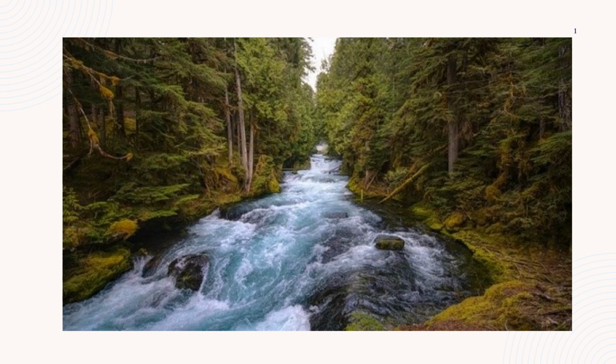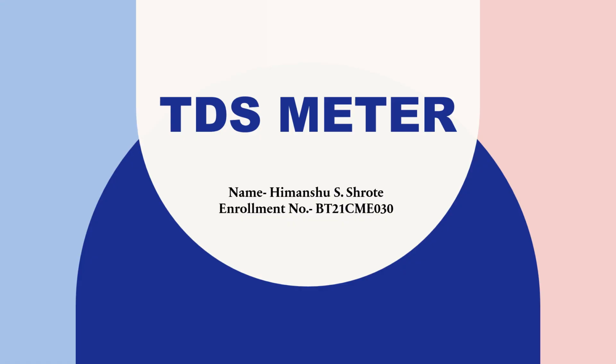Water. Water is the essence of life, but how do we ensure its quality? Meet the TDS meter, a simple yet powerful tool for measuring total dissolved solids. In this presentation, we will explore what a TDS meter is, how it works, and its significance in our daily life.